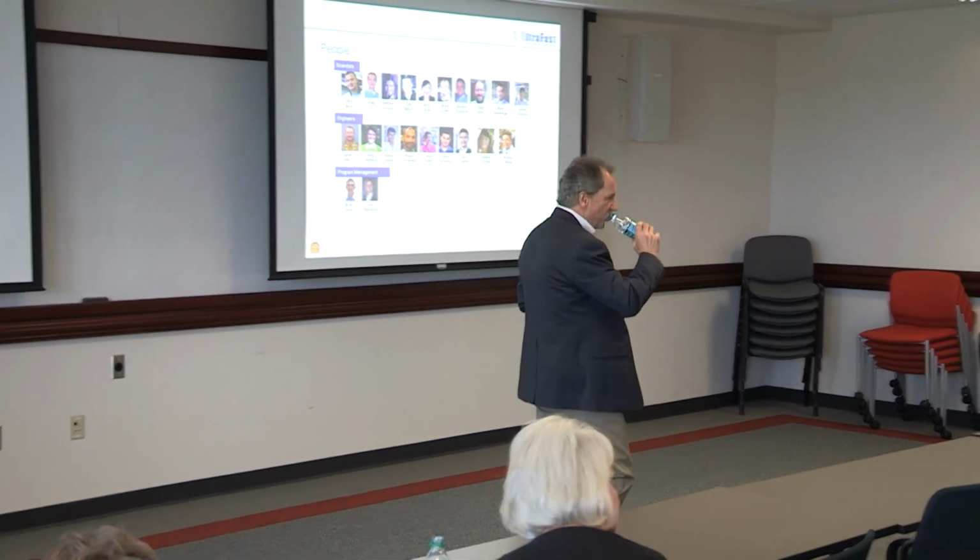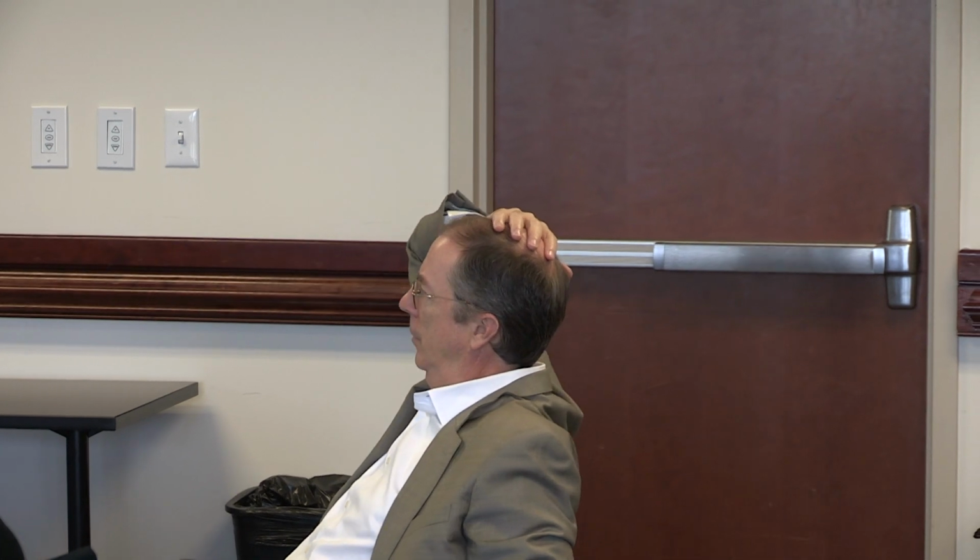I got one. So I probably mispronounced the company. Theranos, yeah. Was that based on microfluidics? I realize it didn't work, but is that what they were going for? Yes. I've got plenty of comments on that, none of which I'm prepared to make on camera. But yeah, it was proposed they had the ultimate microfluidic solution, and I think what was eventually borne out was they didn't. So, yeah, it baffled all of us. For those of us who've worked in this arena, to have a chip that did 15 or 20 different tests off of a drop of blood, it didn't make physical or microfluidic sense. And I guess it doesn't.